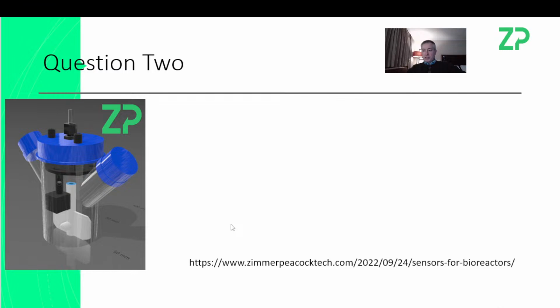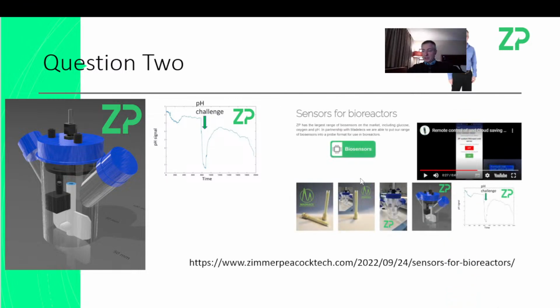I have put a link here that we have already started with some universities, putting our sensors into their bioreactors. So I've listed a useful link there, and hopefully I did put that link underneath the video as well.